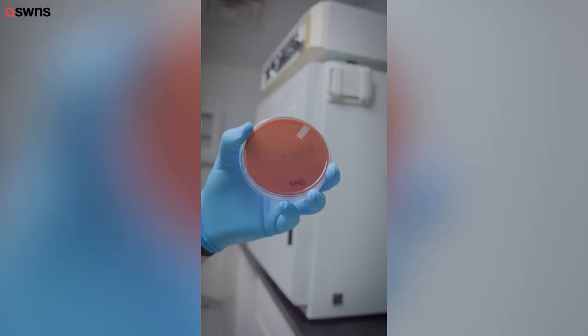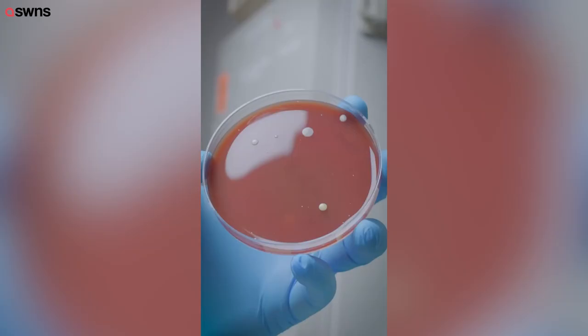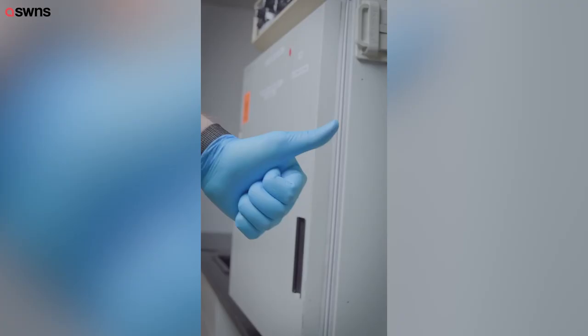And this hand dryer at a store. Well, based off of this test, it looks like waving your hands dry is the best option.